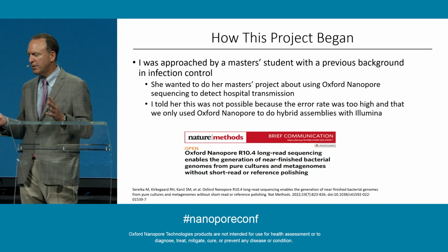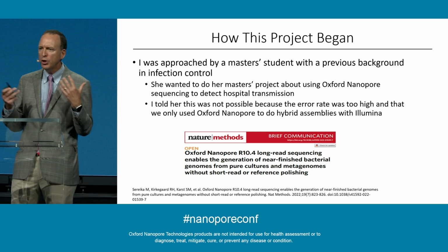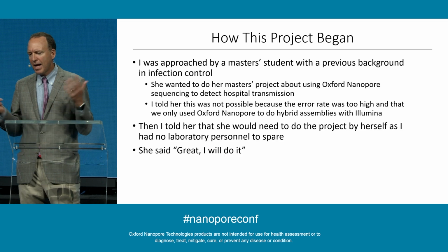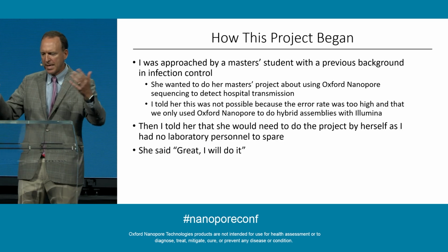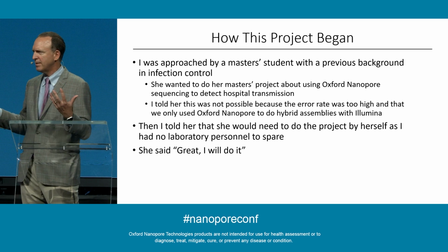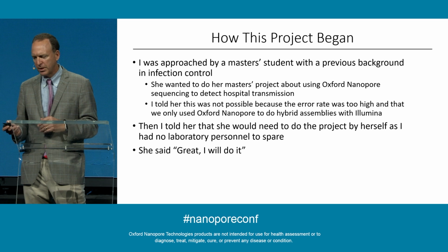She said I should read the literature more, that in 2022, the Oxford Nanopore 10.4 data had come out showing that you could use Oxford Nanopore in a standalone sequencing project. So I kind of perked my head up a little more, said, but I don't have any mechanism to do this right now. My NIH funding is dedicated to other things. And I said, you're going to have to do the project by yourself. I don't have laboratory personnel to do it. And I assumed that being sequencing, it was really labor intensive. And she said, nope, I can do it. So everything that was done by her, which is really quite a remarkable accomplishment.